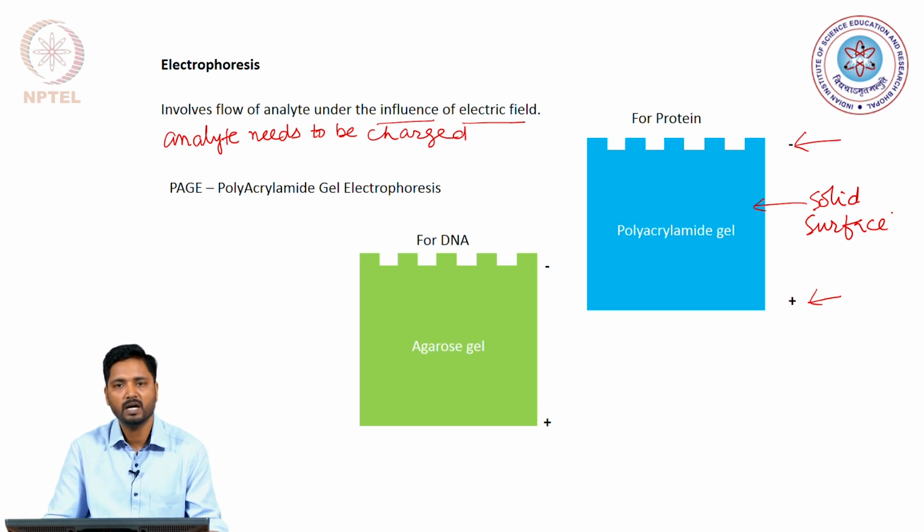So, what we are essentially talking about is a gel like architecture which retains the mechanical integrity while providing a porous architecture within it for the movement of ions and the analyte.